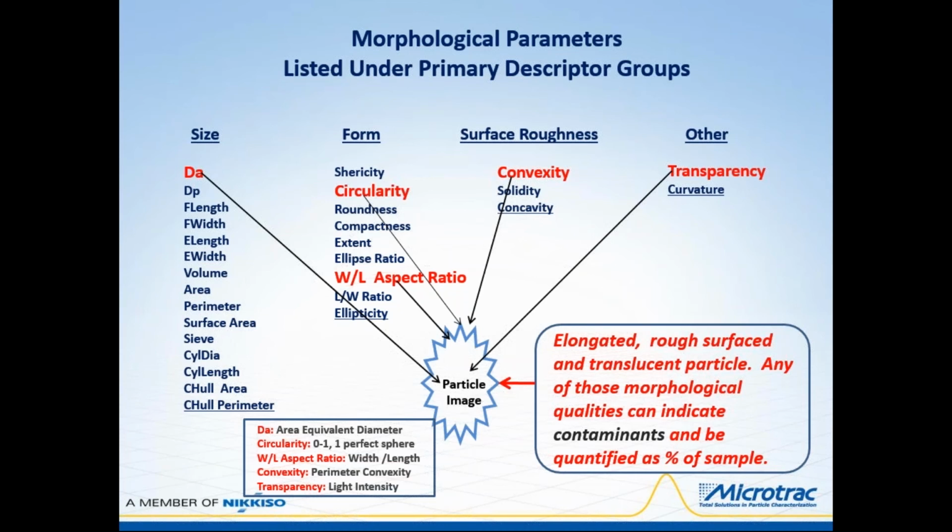Width over length aspect ratio on a scale of 0 to 1, 1 is a perfect sphere. Elliptical forms would be less than 1. Convexity is one of the surface roughness parameters. On a scale of 0 to 1, 1 is a perfectly smooth surface with no concave indentations. Transparency is a measure of the light intensity. A higher transparency indicates a more translucent particle.